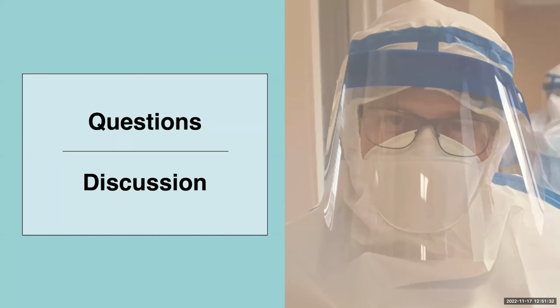I guess the one last thing is don't try to dry the slide with anything that produces a breeze, like a fan or a blower, because then you will more than likely produce fomites. Right. And remember that whenever you're looking at blood or working with blood, that patient could have other infectious diseases. So you need to be careful at all times. It may not be Ebola, it may be something else you do not want to get. So be careful at all times. Universal precautions, bloodborne precautions.